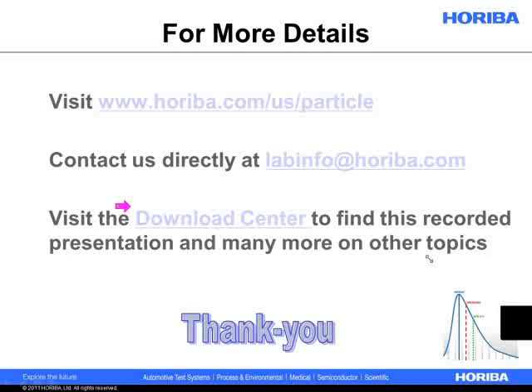A lot of times, let's say you have a needle that has an aspect ratio of 5:1, it's going to appear as a very wide distribution in terms of equivalent spherical diameter, because the needle is going to be spinning a lot of times. Depending on the flow rate and what you're doing with the analyzer, chances are good that the particle is not going to be perfectly aligned as it passes through the laser beam. So it's going to be spinning in all sorts of different orientations, and based on the shape of the particle, some orientations are going to be more likely than others.